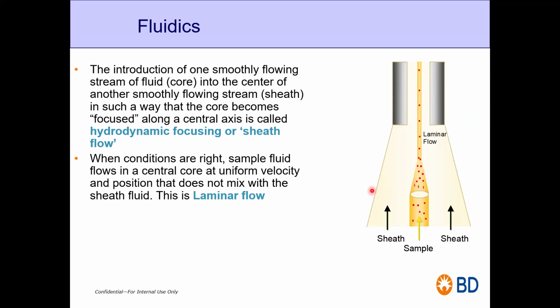I know it might be a bit confusing for you guys, but let's just focus on this, that both of these are liquid, not tubing. And as the laminar flow law says, if your Reynolds number is below 2000, and your velocity is the same, then the flow will be laminar flow.